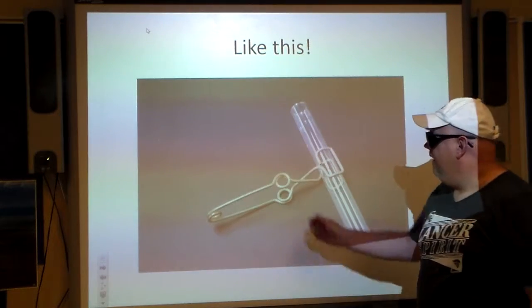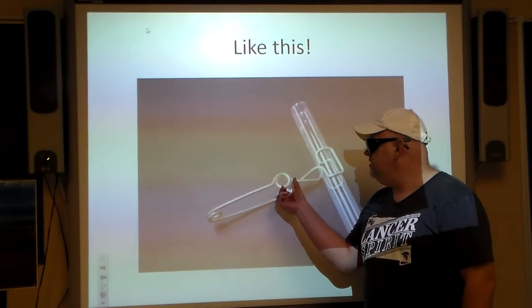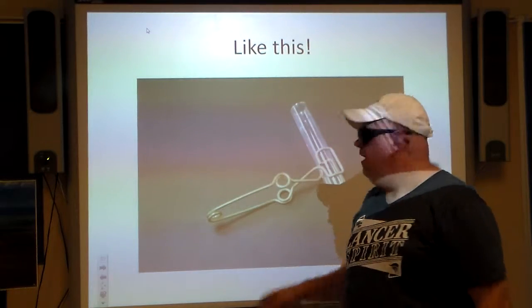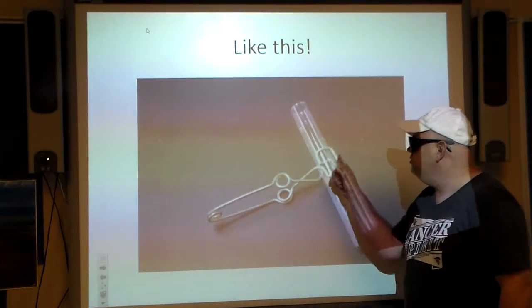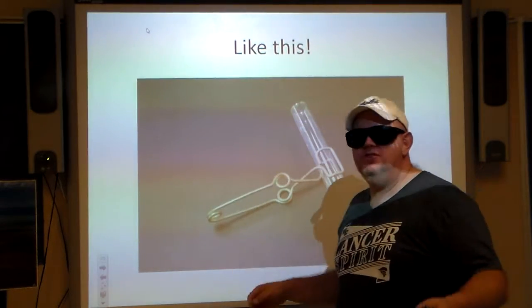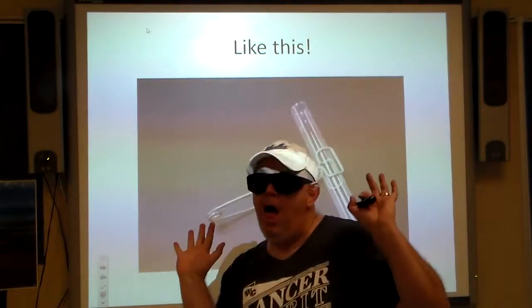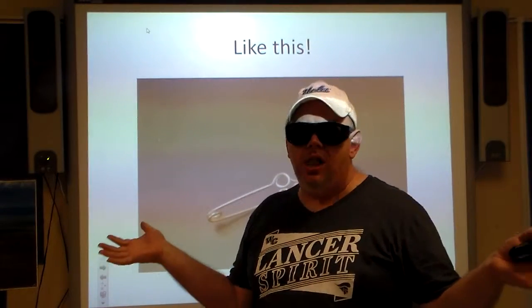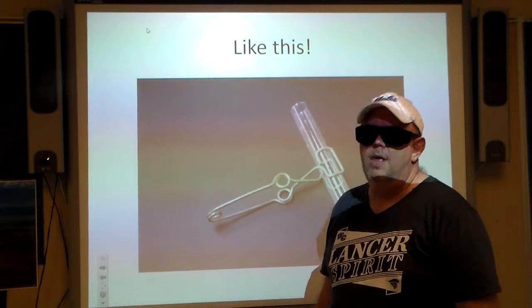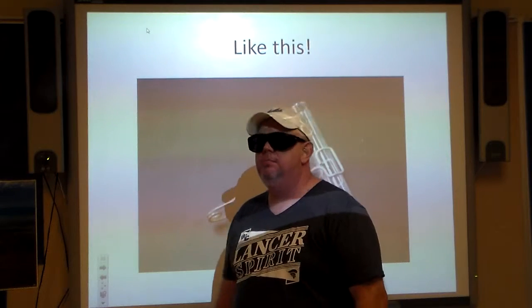Very important: if you sit there and try to squeeze the two parts of the test tube clamp as you're moving along, that is going to make it release the test tube. The test tube hits the floor — now you've got broken glass. We'll cover that in part two.